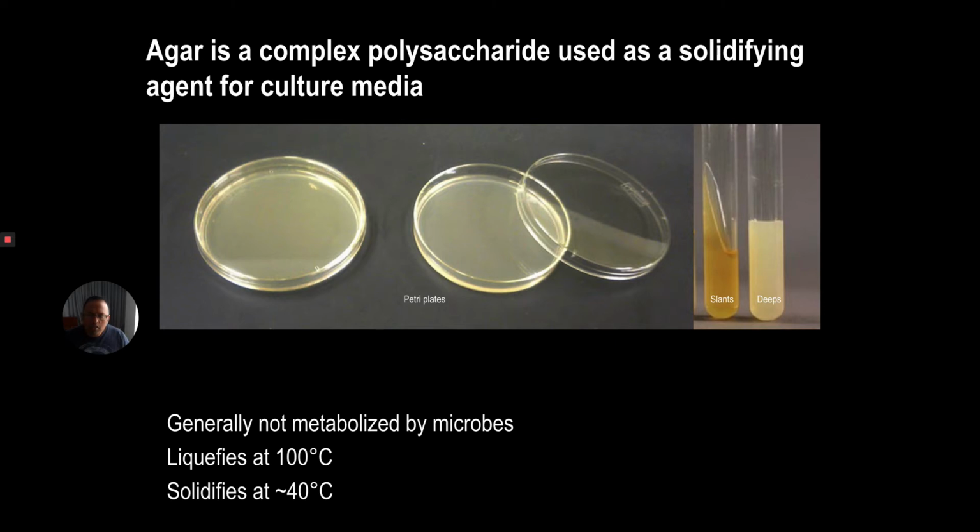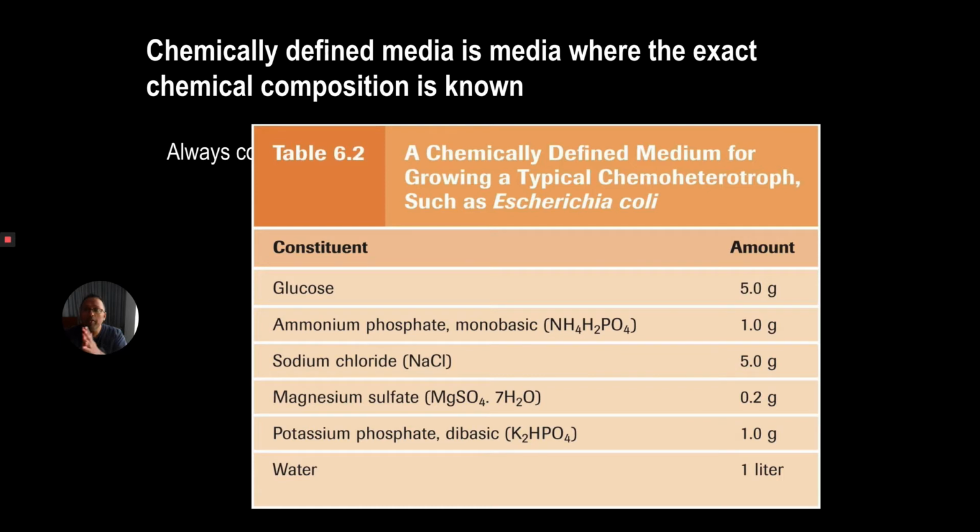But generally, the reason we use agar is because it solidifies the media, and bacteria don't typically eat it. So it liquefies at 100 degrees Celsius and it solidifies at about 40 degrees Celsius. So it's a perfect material for culturing bacteria. And we have two main types of media.